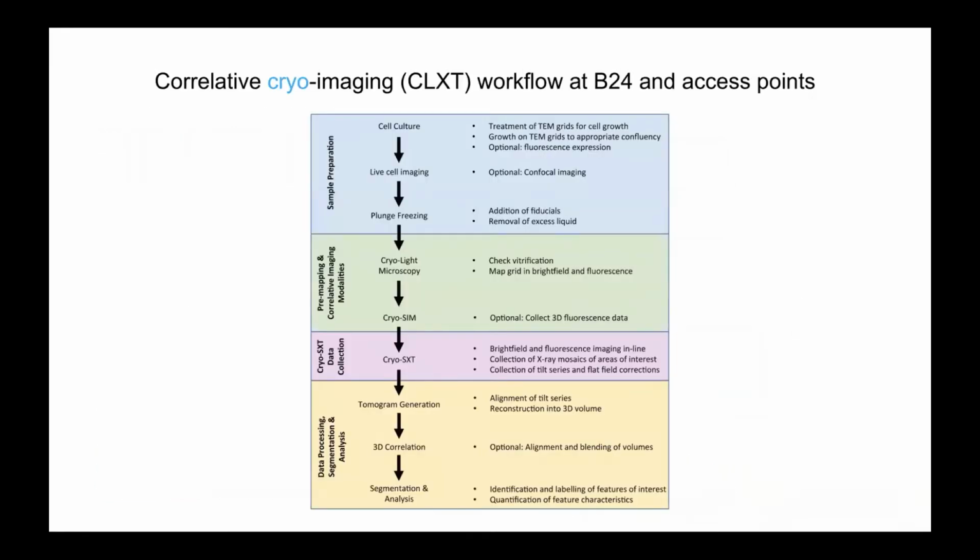Okay, so at the beamline, we have our own workflow. It's fully commissioned, and you'll notice there's several stages. We take from cell culture, live cell imaging, and all the associated work to plunge freezing, and then we go into microscopy, super resolution fluorescence or X-ray, and then we have an in silico side.